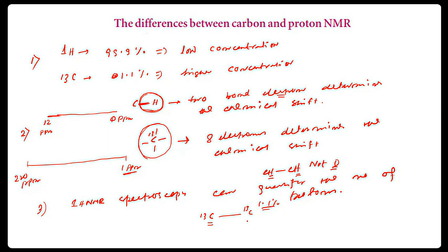That's why 13C NMR spectroscopy cannot quantify or indicate the number of carbons.